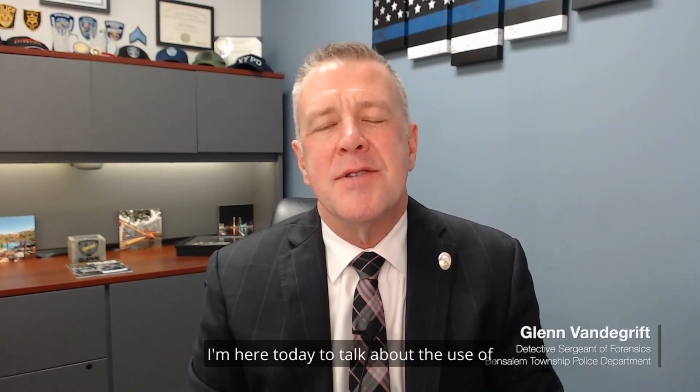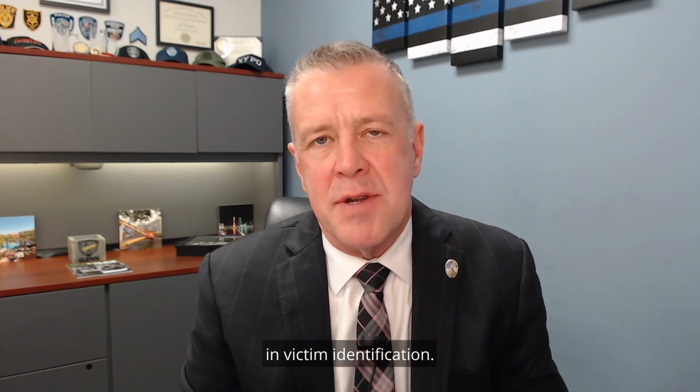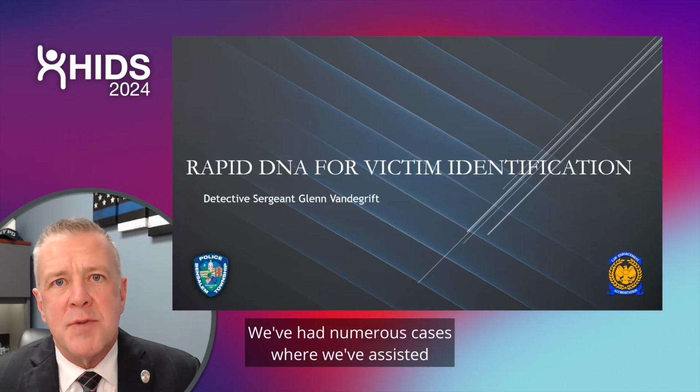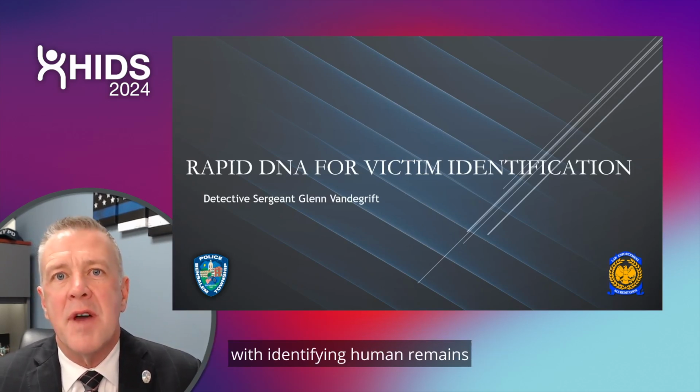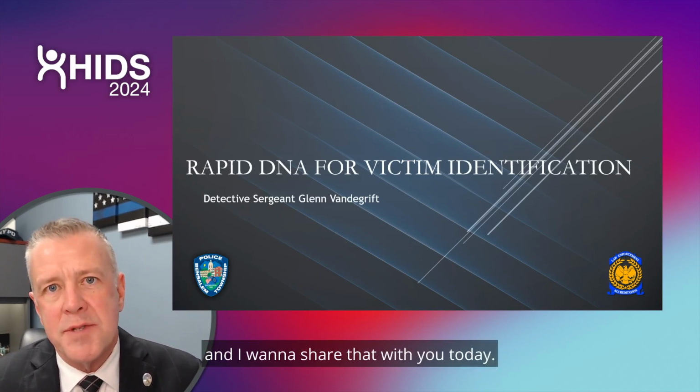I'm here today to talk about the use of our rapid DNA instrument from Thermo Fisher in victim identification. We've had numerous cases where we've assisted outside agencies and our coroner's office with identifying human remains, and I want to share that with you today.